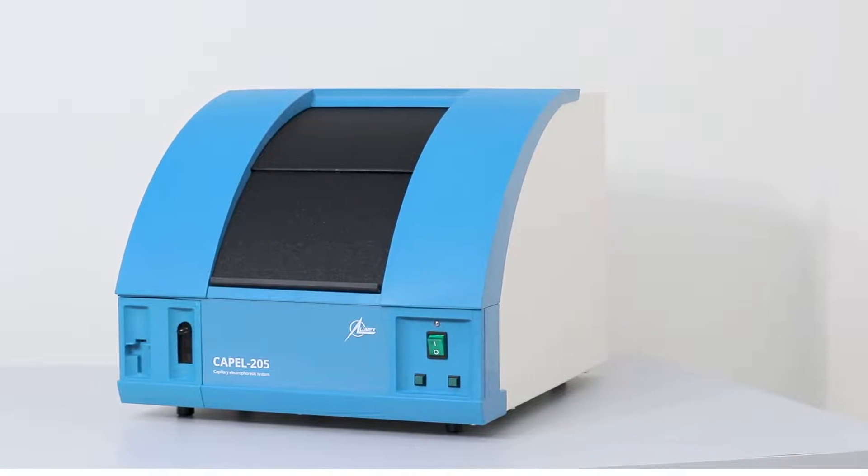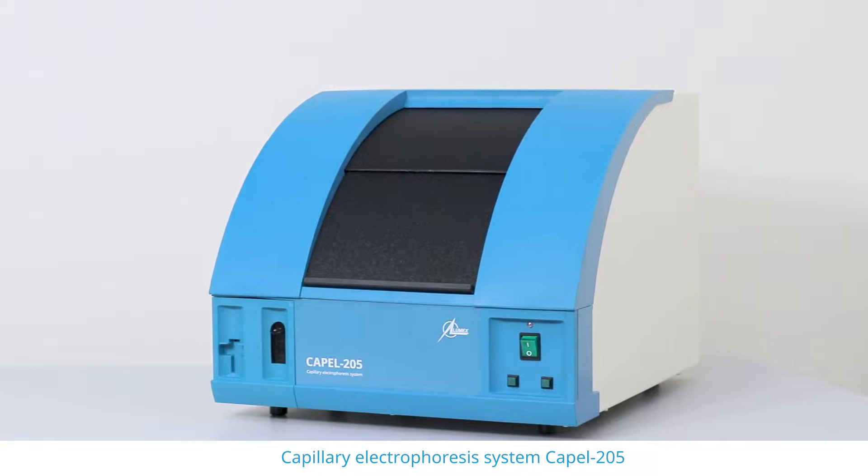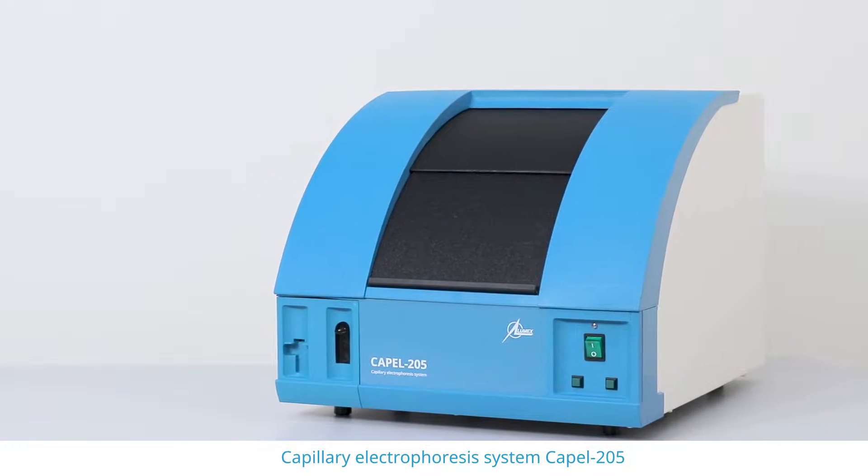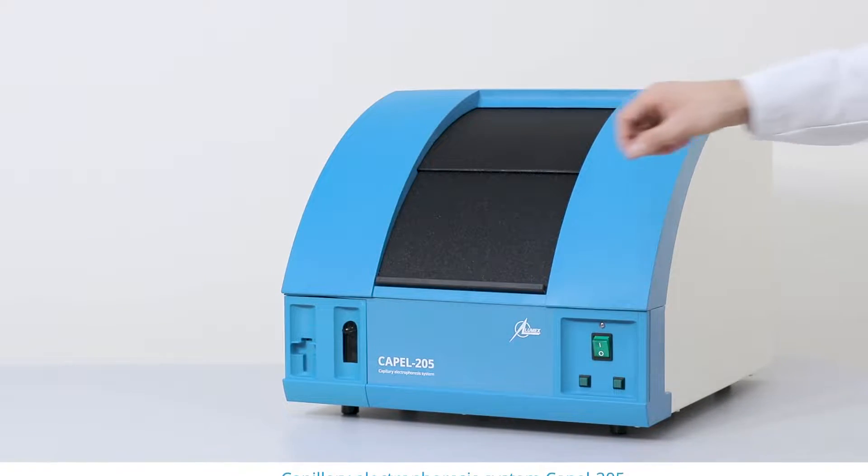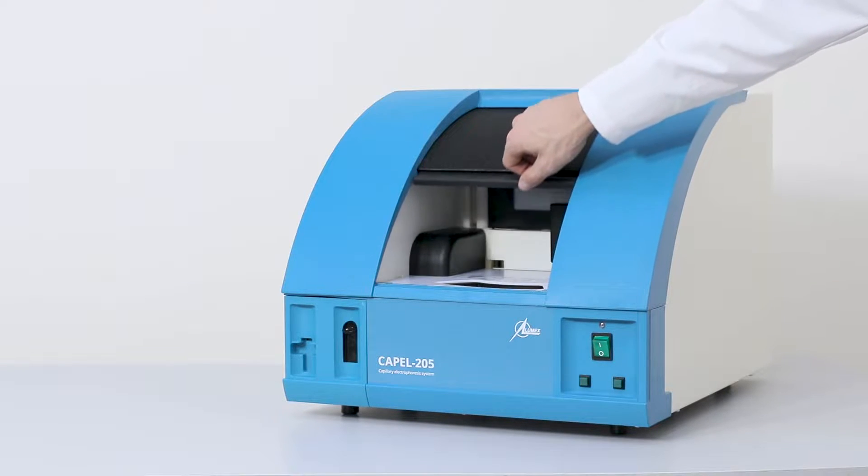In this video, we will introduce you to the new capillary electrophoresis system, CAPEL 205, developed and manufactured by Lumex Instruments.